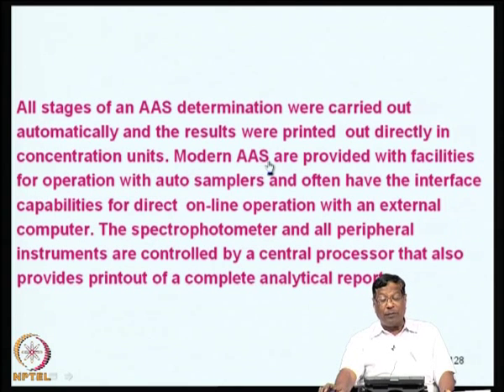Modern atomic absorption spectrometers are provided with facilities like operation with auto samplers also, and you will have to program the auto sampler for your requirement. They have the interface capabilities for direct online operation with an external computer also. The spectrophotometer and all peripheral instruments are controlled by a central processor that also provides the printout of a complete analytical report.